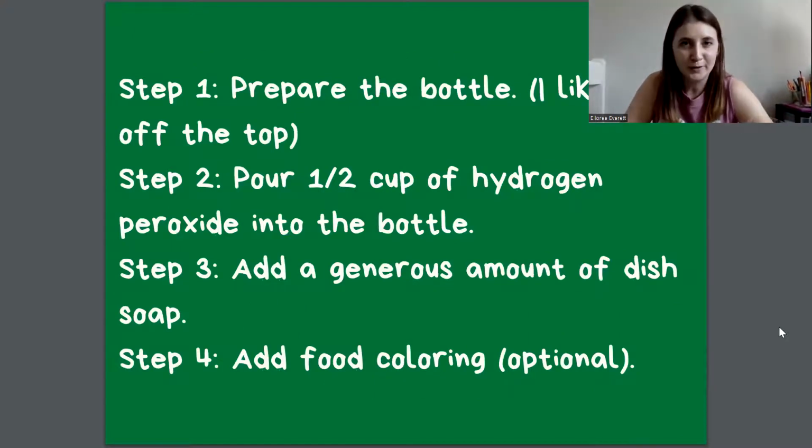Step 1, prepare your bottle. Meaning if you're using a plastic bottle, probably cut the top off. If you're using a graduated cylinder, an Erlenmeyer flask, or just a beaker, you don't need to do anything. Just grab it.